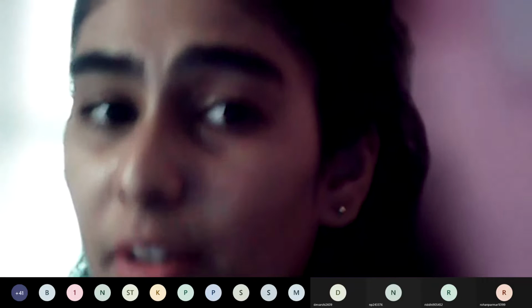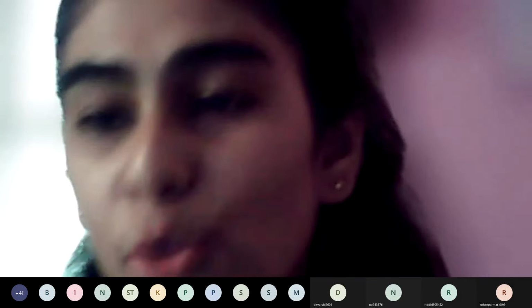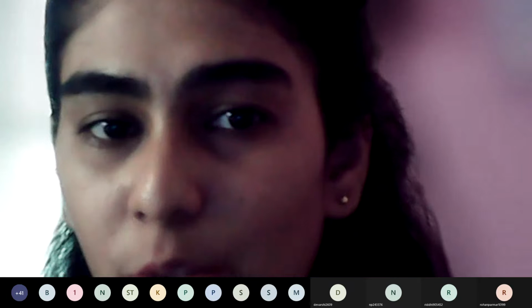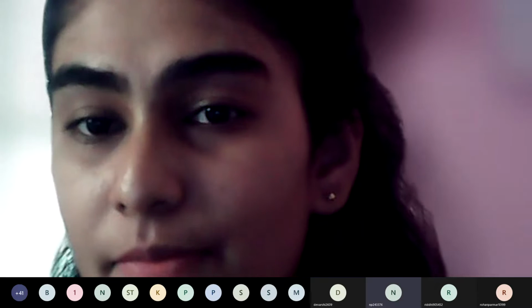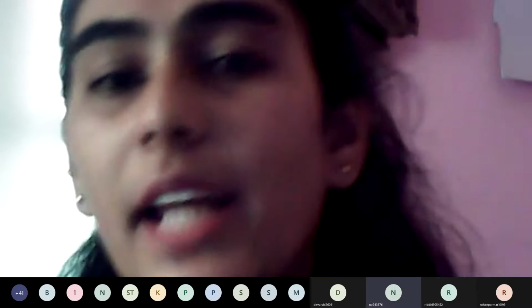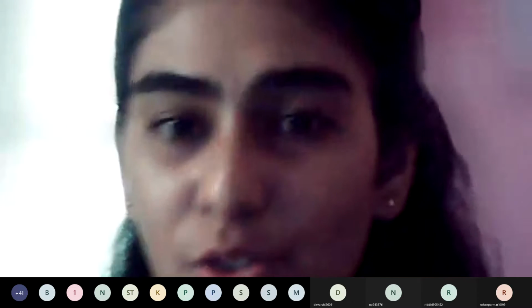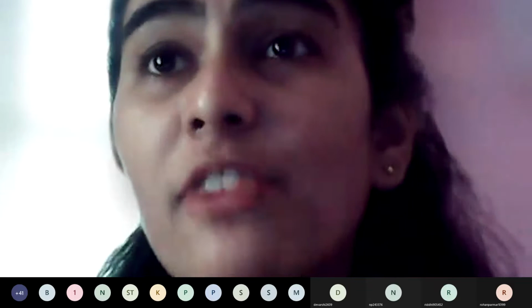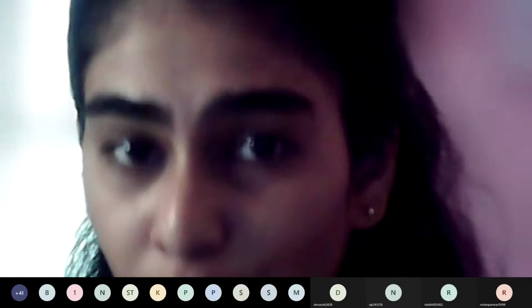Now this thin layer chromatography is a two-dimensional chromatography. So you might have performed a practical on paper chromatography in your graduation. I believe you have done that. Did you do paper chromatography or TLC, which have you performed? TLC. अच्छा, you have performed TLC. अच्छा बताइए, what have you done in your TLC practical? Tell me what was your stationary phase, and what kind of mobile phase you have chosen. You have performed TLC, so it is not a new thing for you.